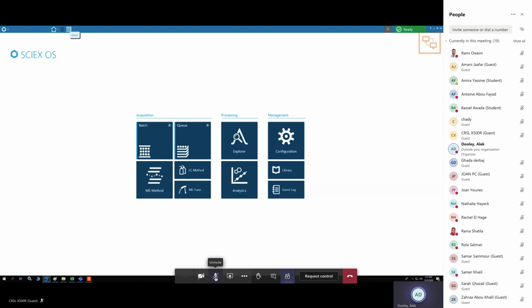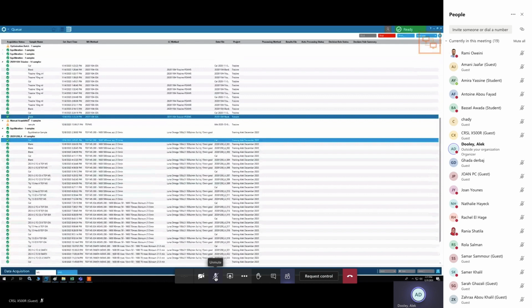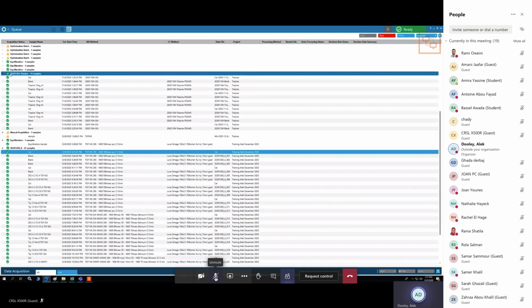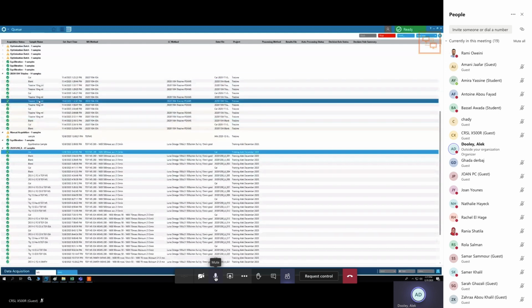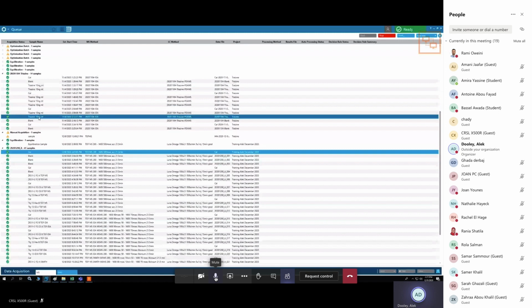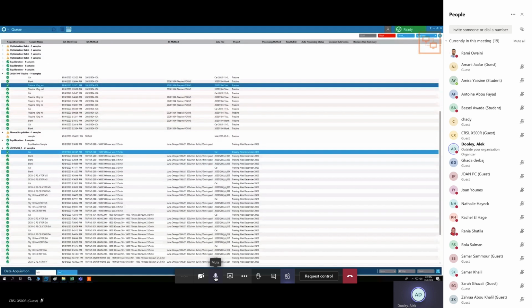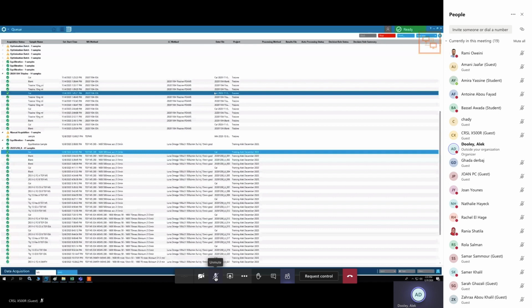So let's see, what do we have? So that would be in the queue, right? So here, so these are the triazine here? Yes, that's it. Okay, and you just ran 10 nanograms per mil? Correct. Yes. Okay, so all right, we can start with that, no problem. That's in a different project, that's in the triazine project. All right, so you have a choice. Well, let's start in the automated, that's easier.